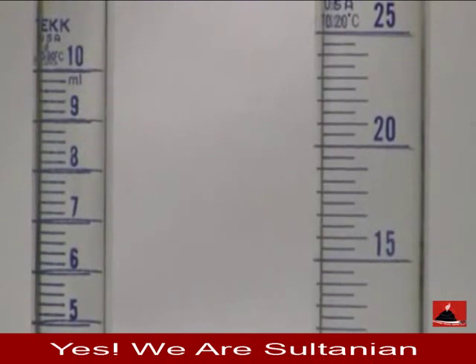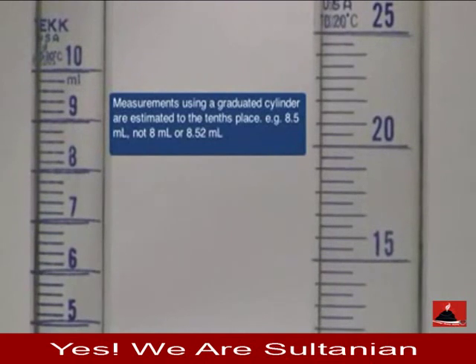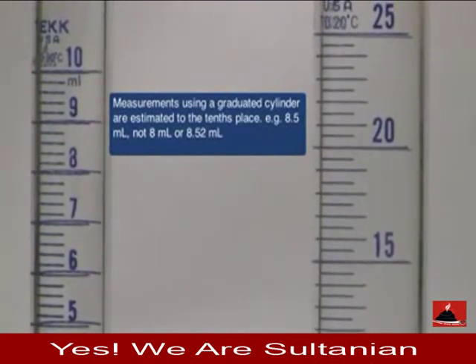When you take measurements, you want to take it to the tenths place. For example, 8.5 milliliters would be a good reading rather than just 8 milliliters or 8.52 milliliters.